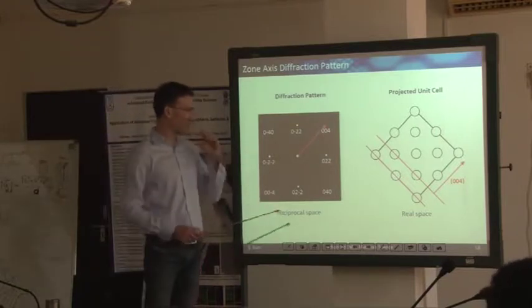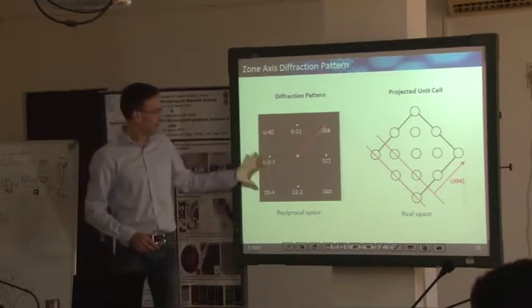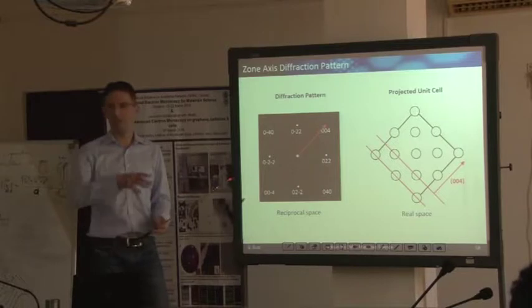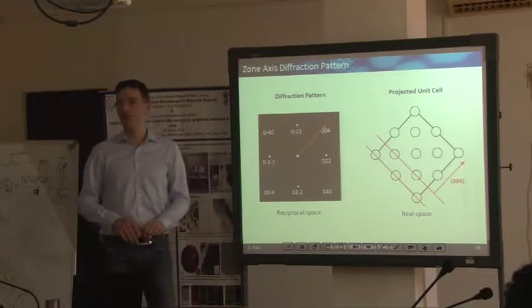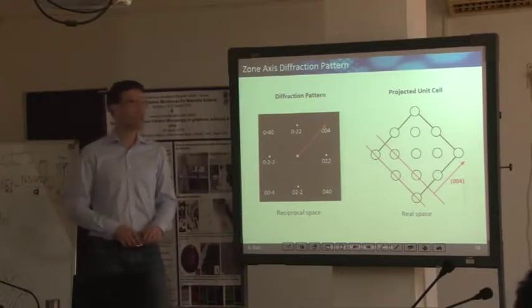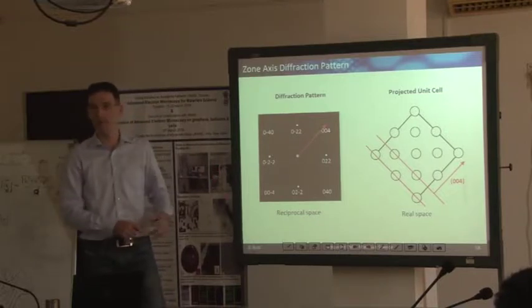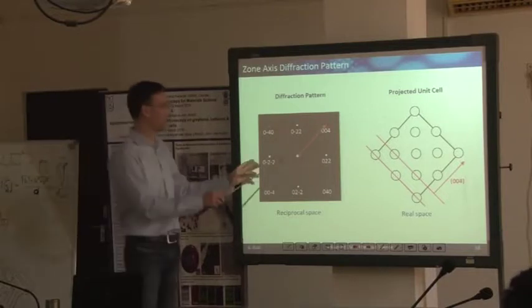What you would do is take a diffraction pattern along a highly symmetrical direction, and you can easily identify highly symmetrical directions on your viewing screen. Then, for a very complicated crystalline structure, you would start with a simulation to compare to your diffraction pattern. For the silicon here, we know the selection rules; you can write them down on half a sheet of paper and calculate that. So we know which reflections should show up.